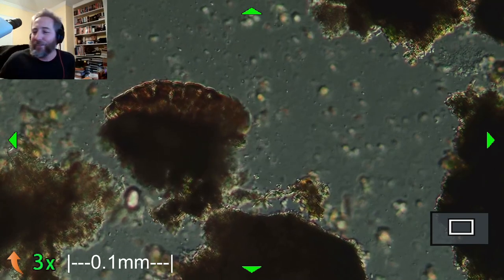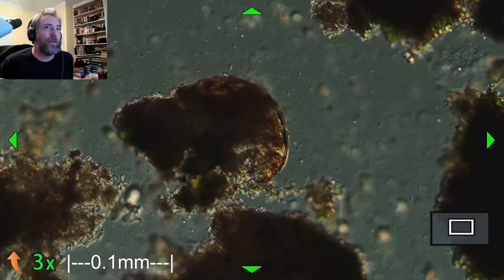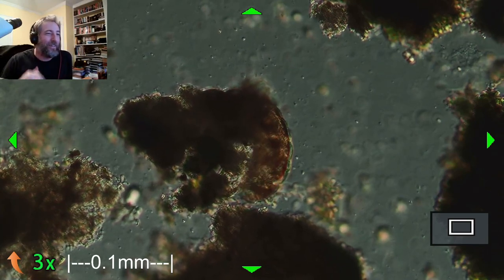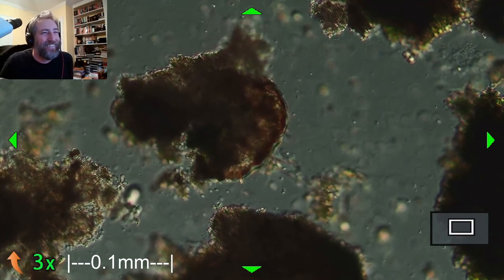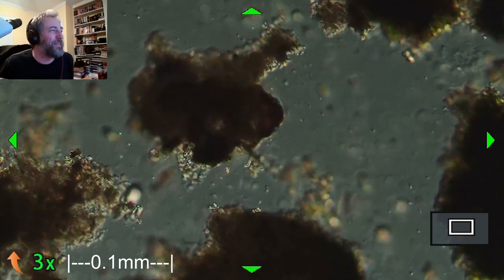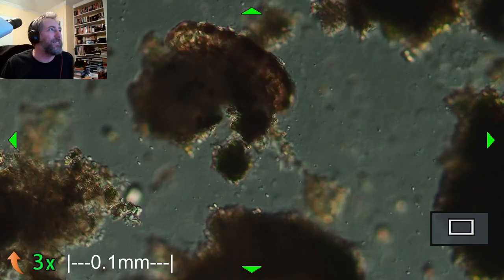there's not much there, right? Yeah, like a little Lazarus. You just add some water. It's more like water bear hot chocolate. You add a little bit of water and then you got hot chocolate, and then you let it dry out and you got powdered chocolate again. One lasted 140 years. Yeah, I believe it. Once you're in a dehydrated state, most organisms are good for a really long time.